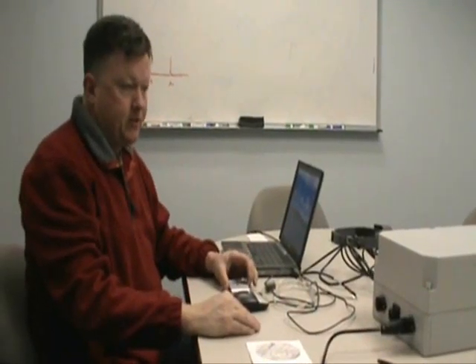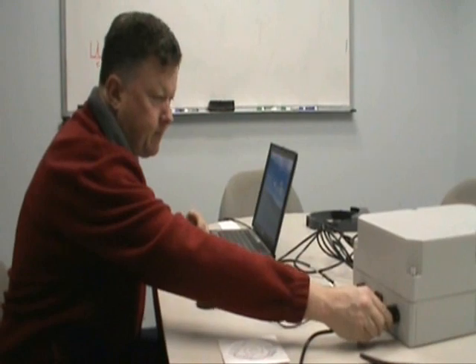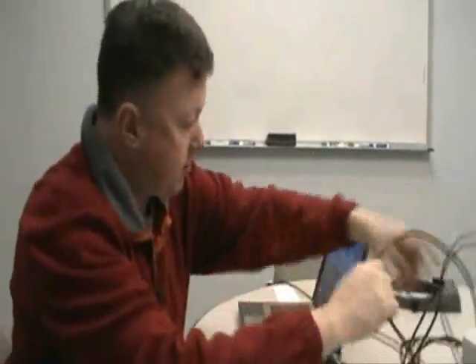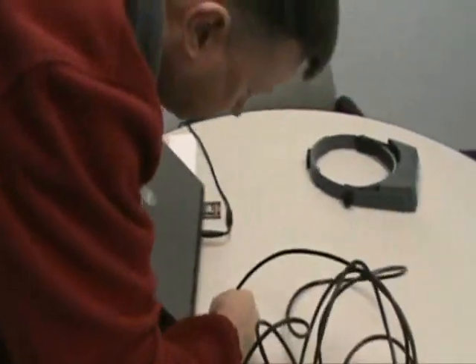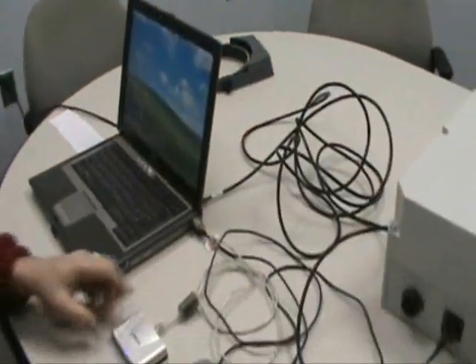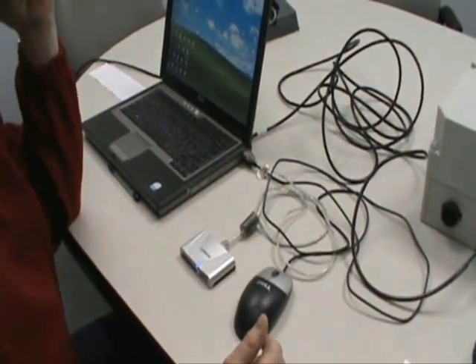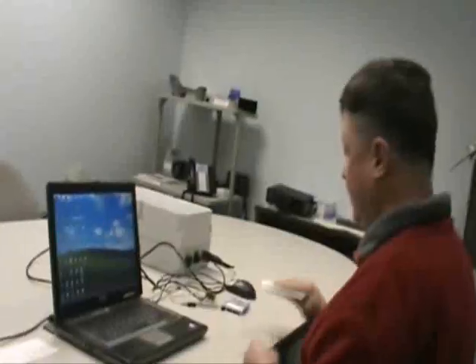The setup instructions for the PGT area monitor is as such. You'll first plug in the AC mains cable, then the supplied Ethernet cable. Connect the other end of the Ethernet cable to your networking card on your computer. Okay. One other piece of equipment that you will need to modify the internal flash card of the unit is a flash card reader, which is needed to edit the IP address of the unit itself to match the computer that you're going to hook it up to.